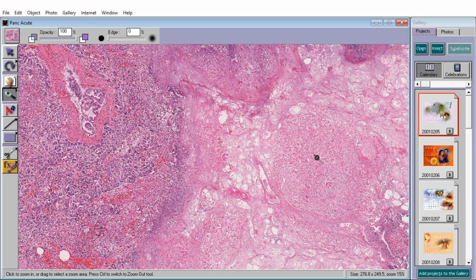And I know what you're thinking. You're thinking, well, if it's acute pancreatitis, shouldn't it have a lot of neutrophils infiltrating it? Yeah, that's possible. But guess what? Once this pancreas is damaged acutely, it releases all of its digestive enzymes into itself. And now you have what doesn't look like a normal pancreas anymore. You have what looks like a partially digested piece of meat that came out of the patient's stomach. This is what they call autodigestion of acute pancreatitis.